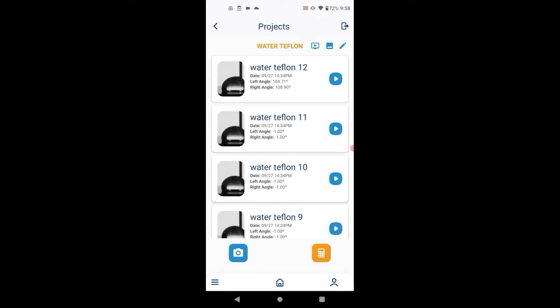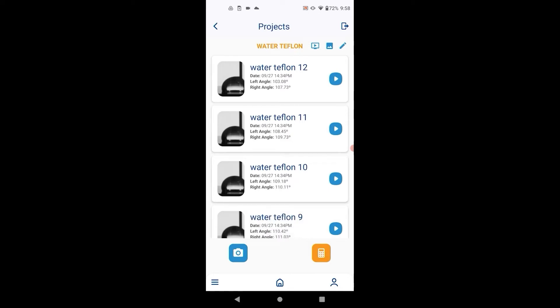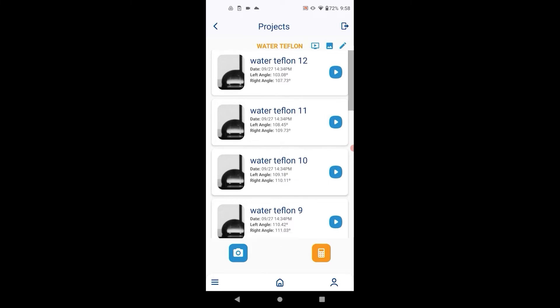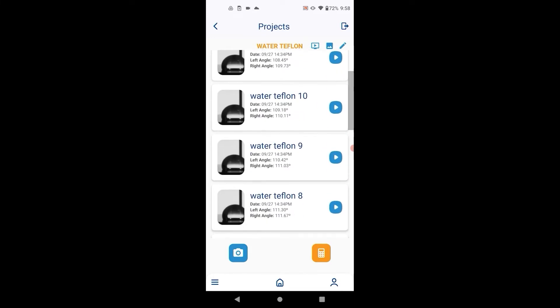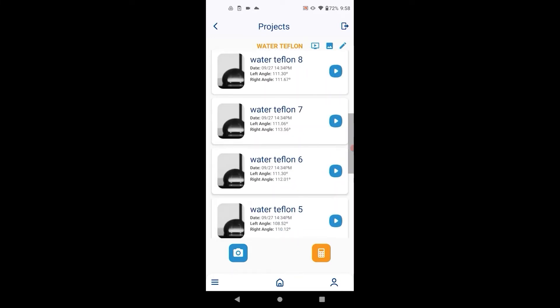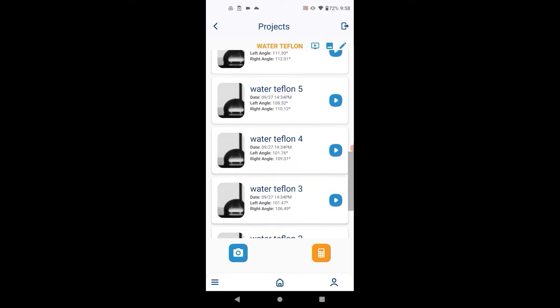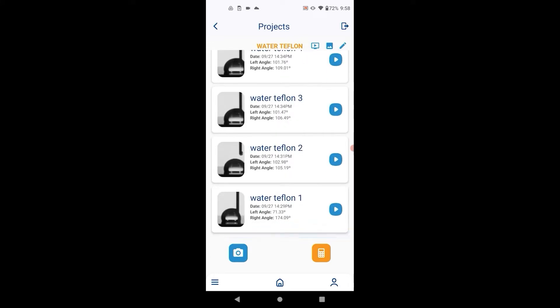Once you are ready, go to one of the images and do the entire calculation process including calibration. If using the Young-Laplace method, go back and hit 'calculate all' to process all the images captured in this timeframe. After completing one calculation in a series of images, the rest of the images can be automatically calculated from the project screen, if all the settings were the same for each image.